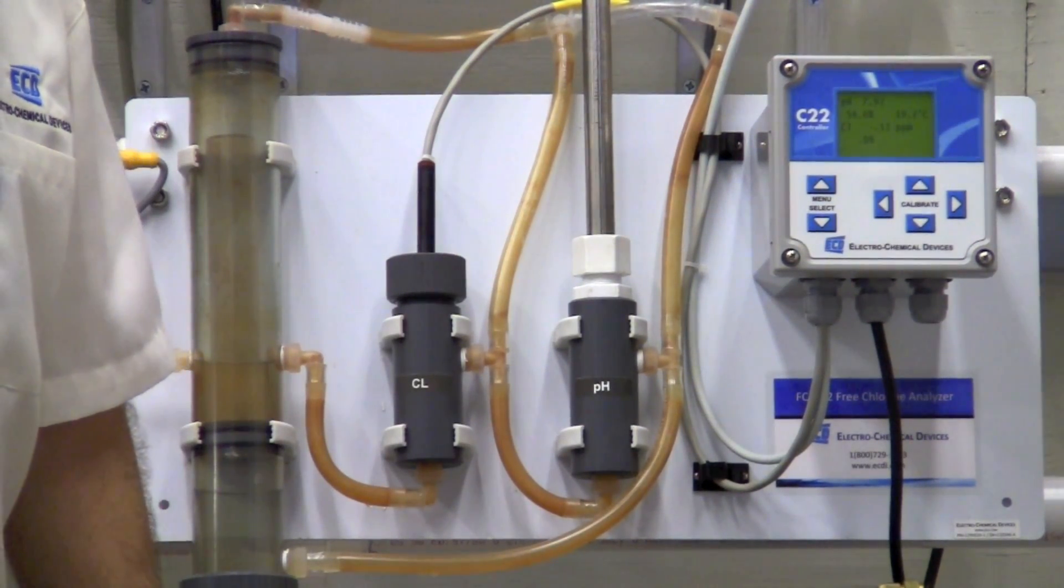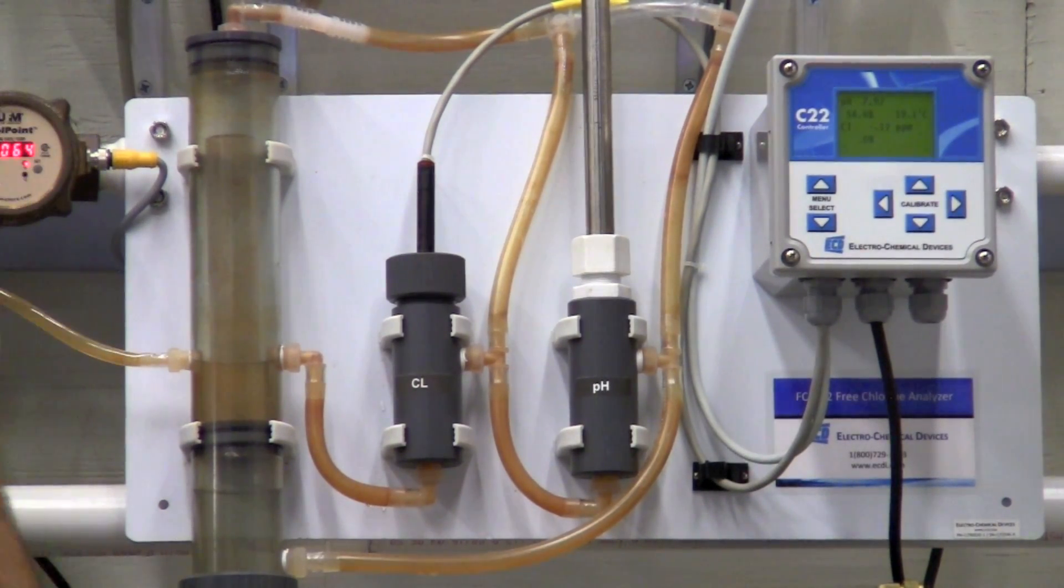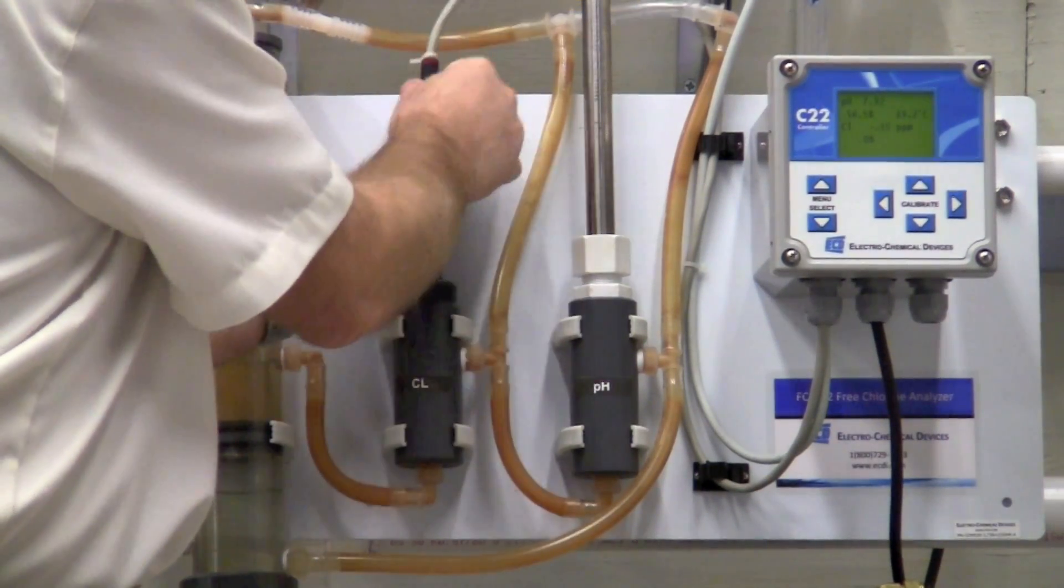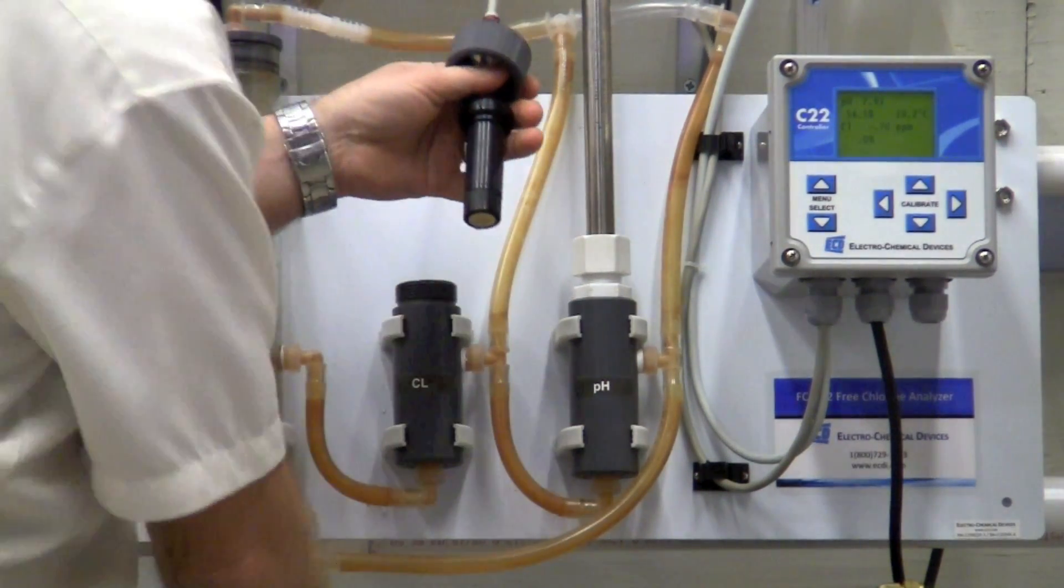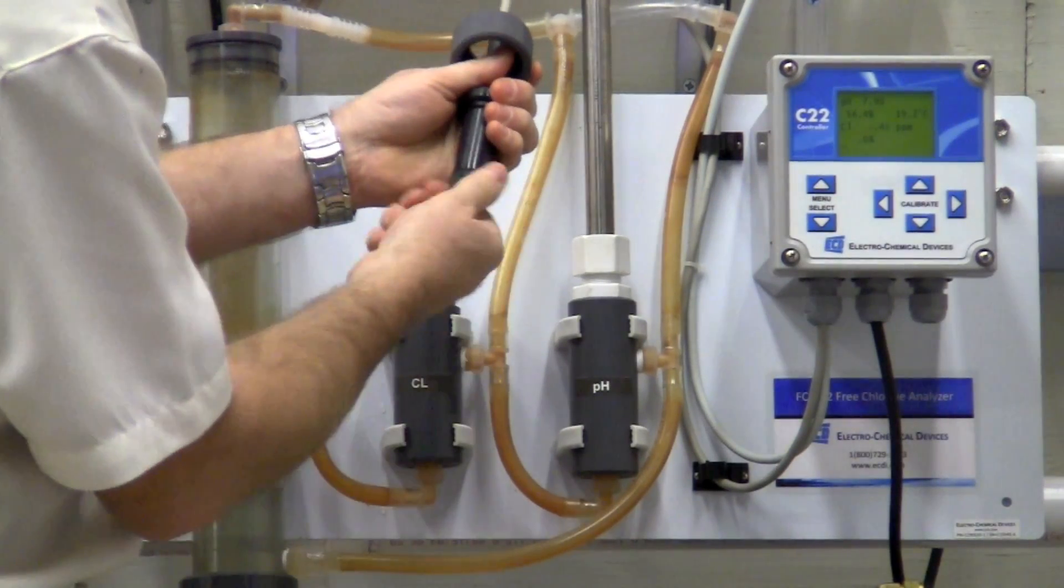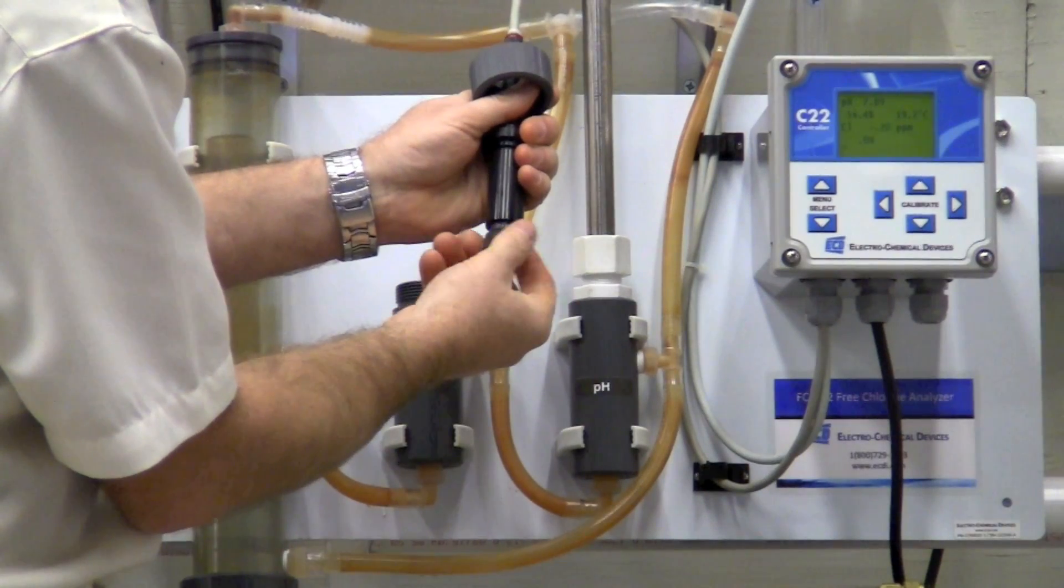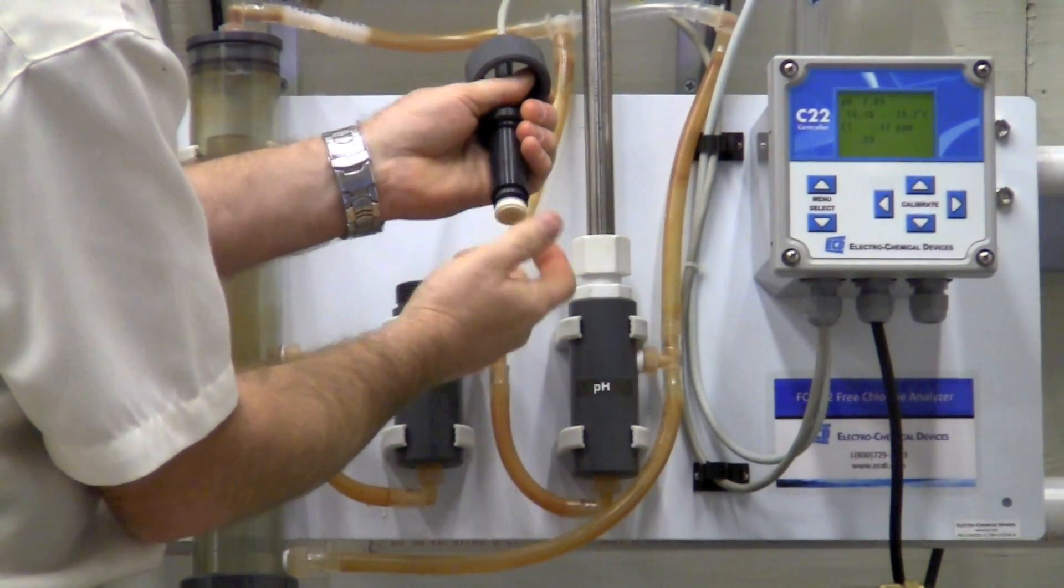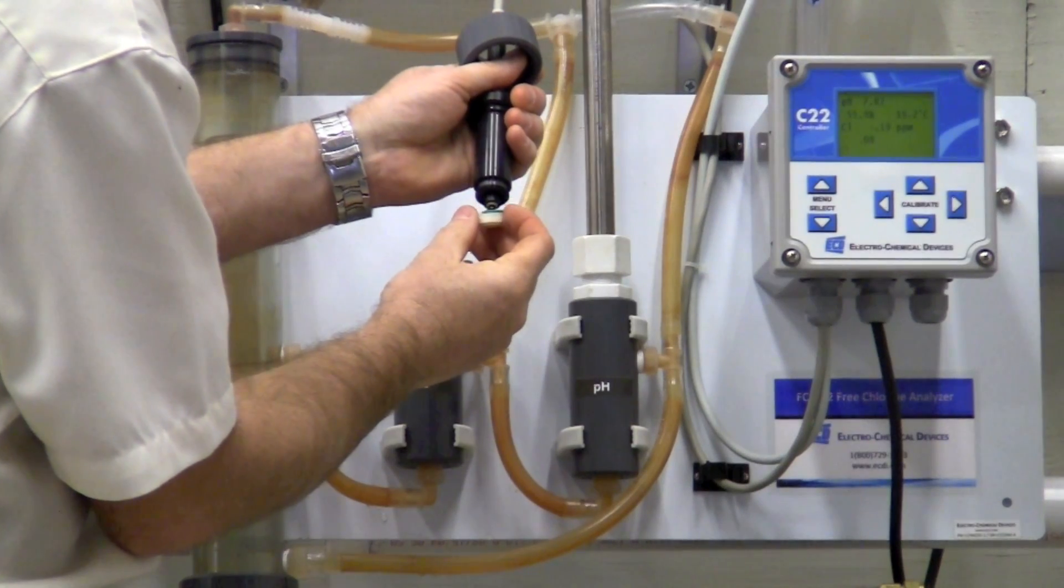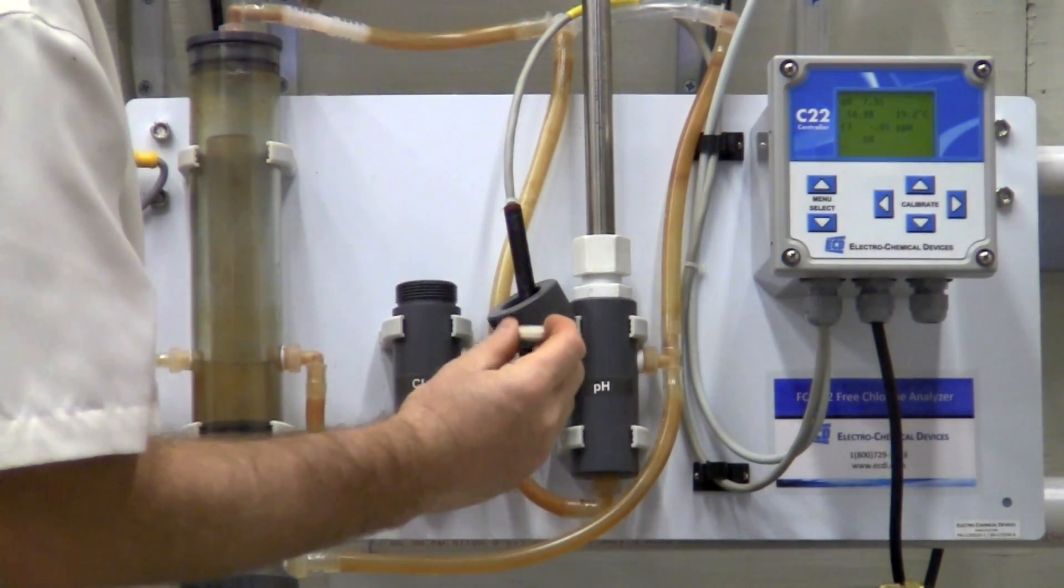Maintenance of the chlorine sensor is periodic refilling of the electrolyte and/or replacement of the chlorine membrane. Removing the chlorine from the flow cell, you've got a cap on the front that is unscrewed and then the cartridge itself is removed.